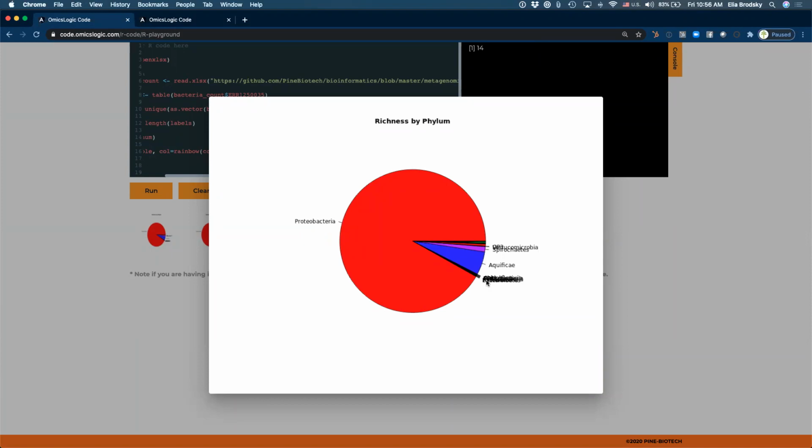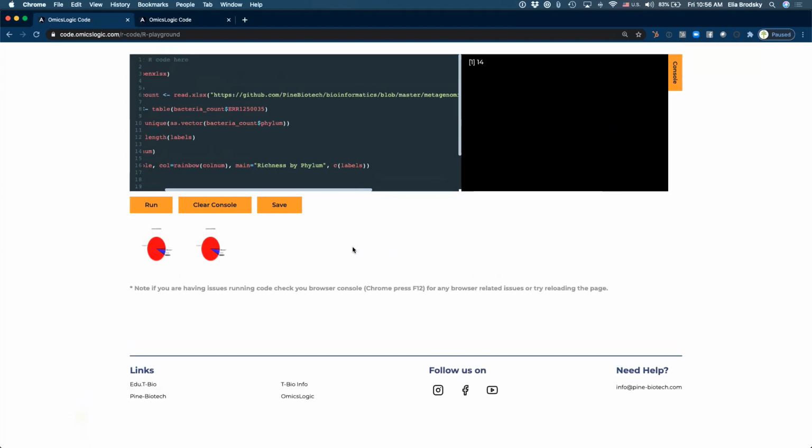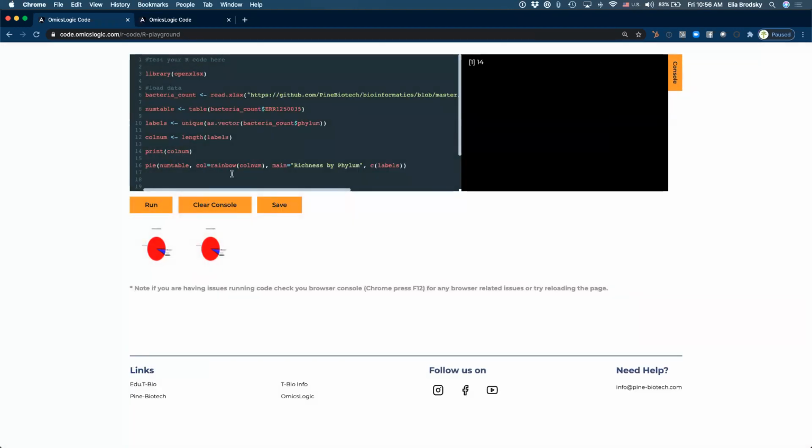I'm just going to already tell you that this is not exactly correct. There are some more things that you need to do, but just based on this, you can already see where we are going with this code.